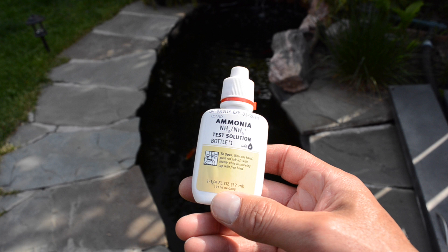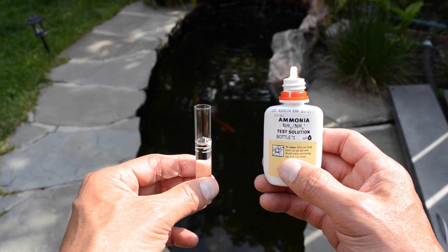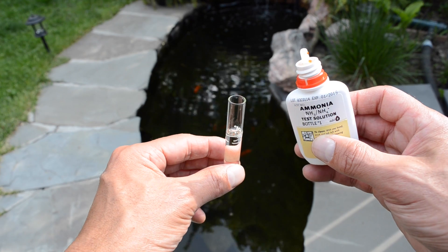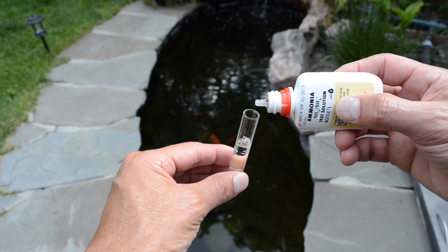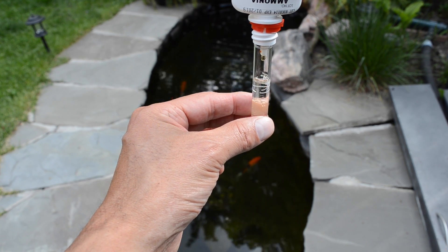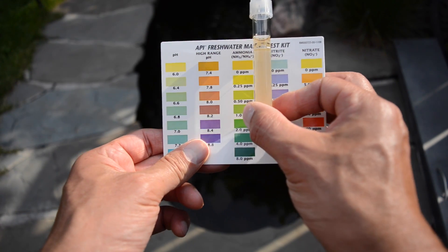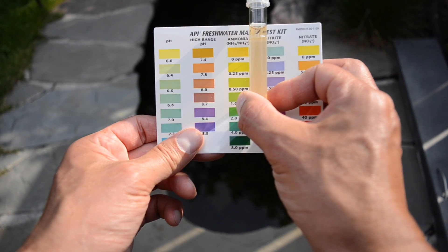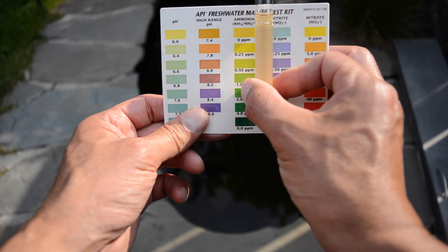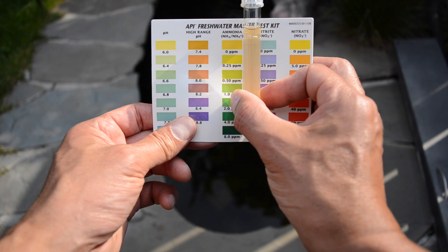We're going to add eight drops of the ammonia test solution to the bottle and let it sit for about five minutes until it can create a reading. Okay, so here is a check of the ammonia level — about five minutes have passed. When I hold it up against the chart, it is very much the lightest color, no real traces of green anywhere, which tells us we have a very, very low ammonia level. I'm quite happy about that one.